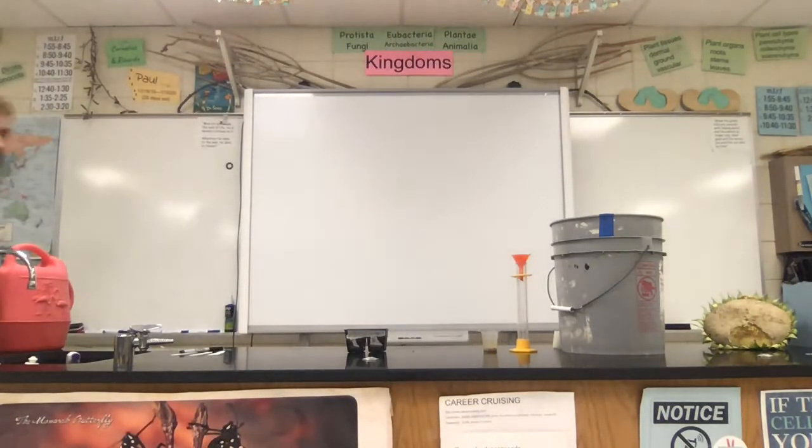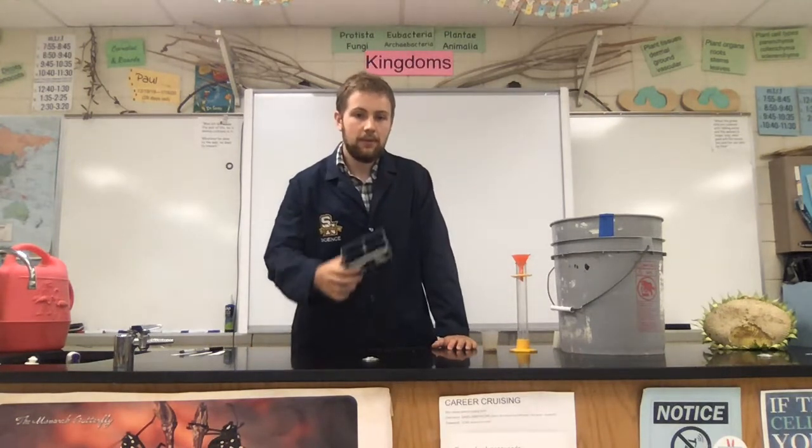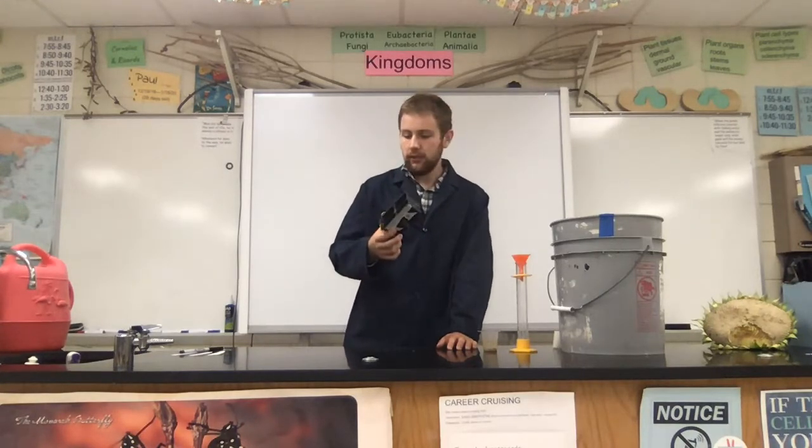All right, so the first thing we have to do in our tomato lab is we've got to fill this planter and set up this 4-quadrant planter correctly. So let me bring it over and show you what I have done.